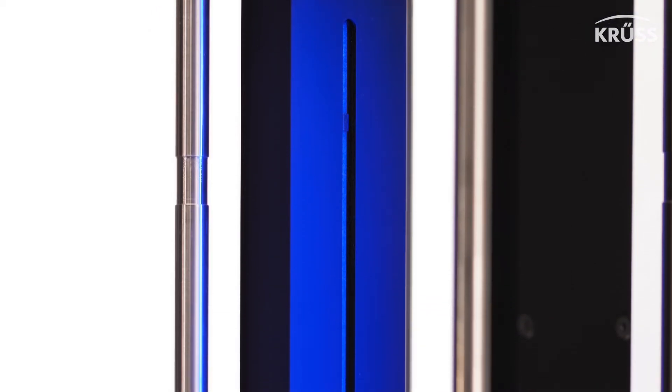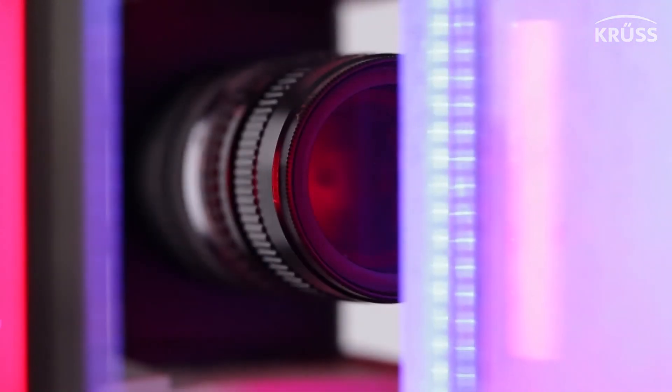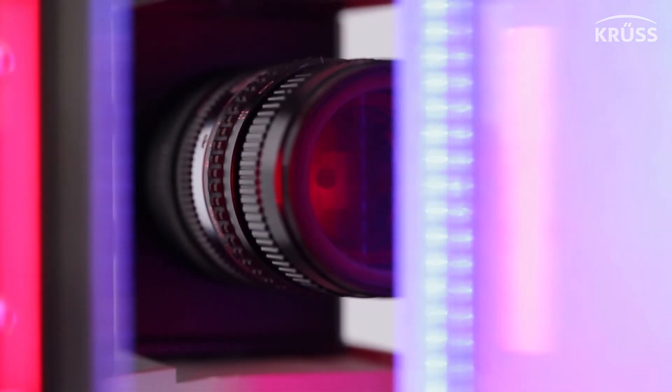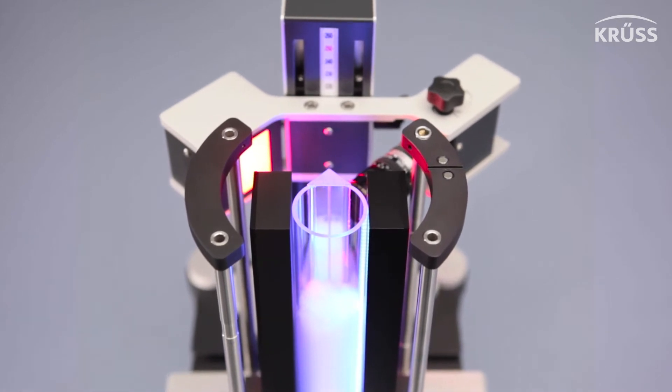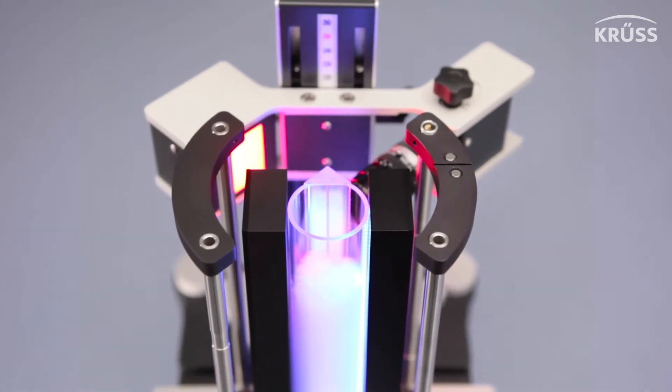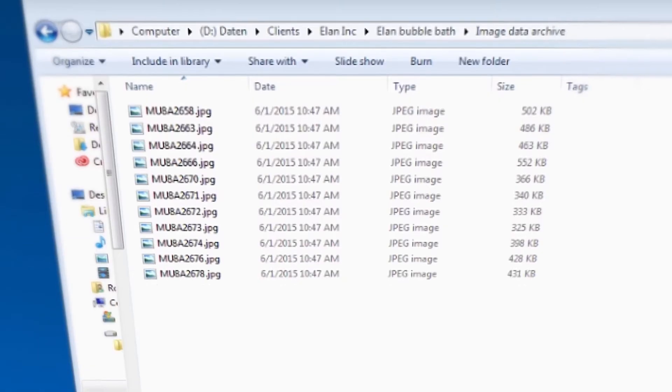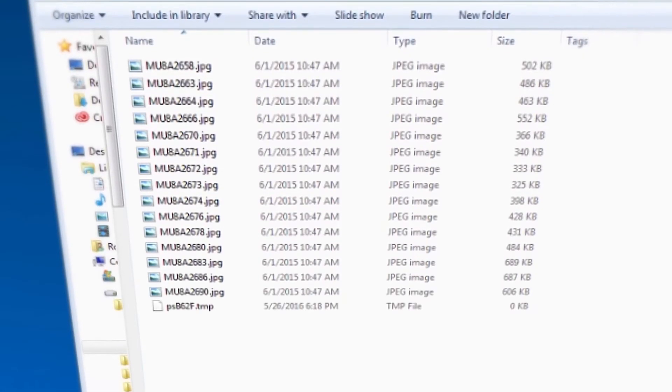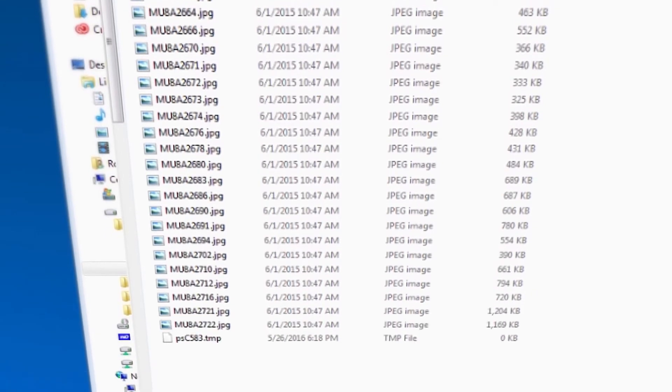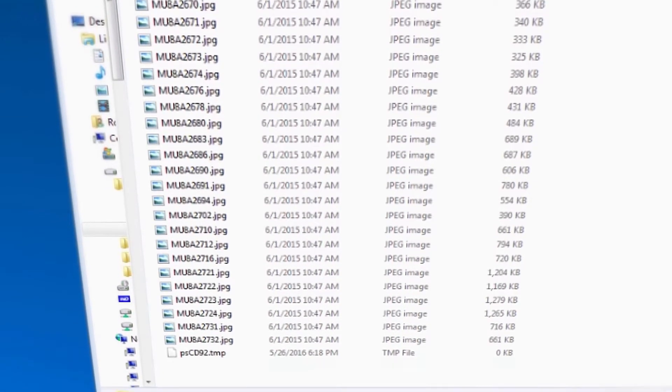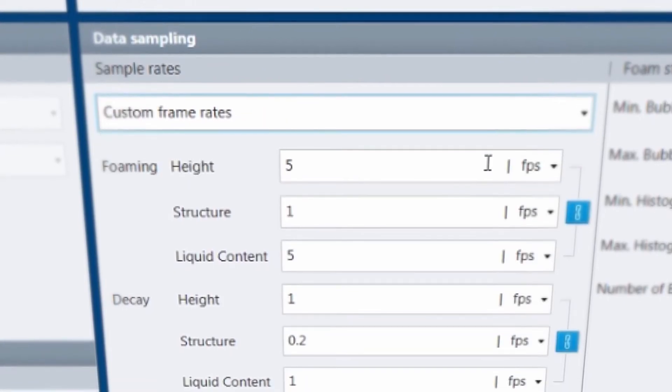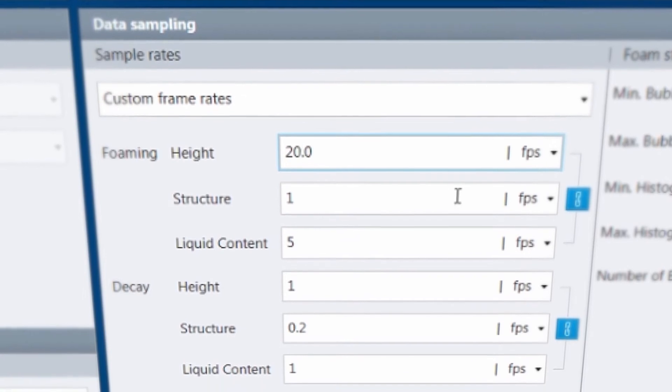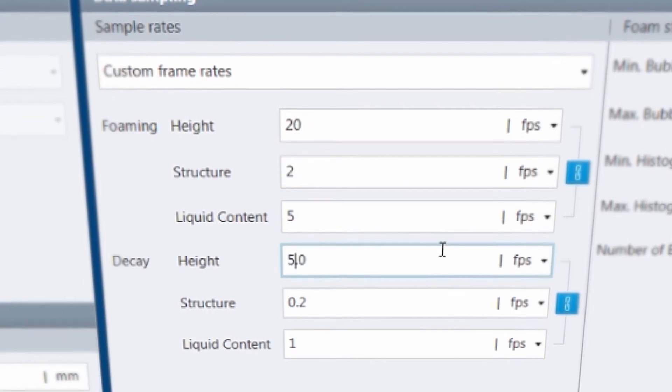Another way we strive to make scientific measurements faster and easier is by designing the frame rate of the instrument's high definition sensors to be set automatically using intelligent algorithms which calculate the optimal compromise between large numbers of analyzable images and small data storage size. However, you can also control the frame rate manually for special situations.